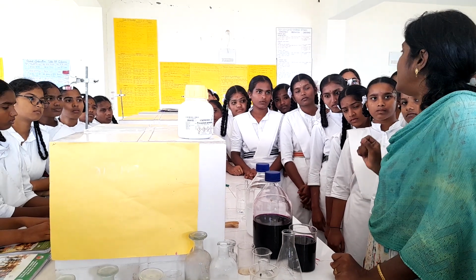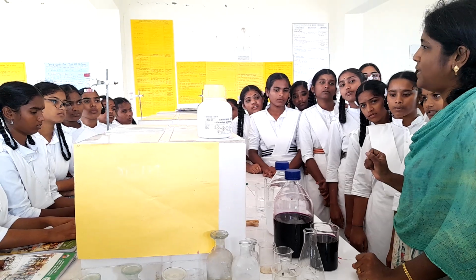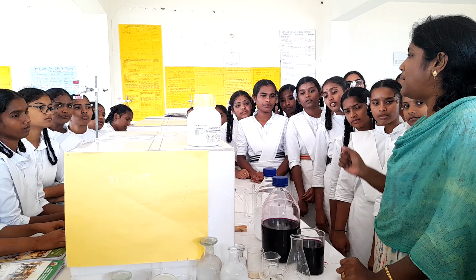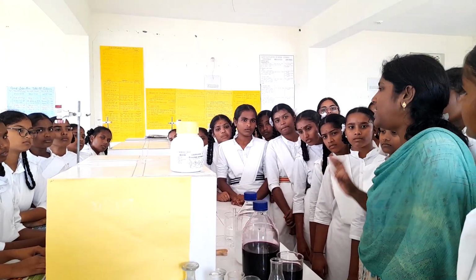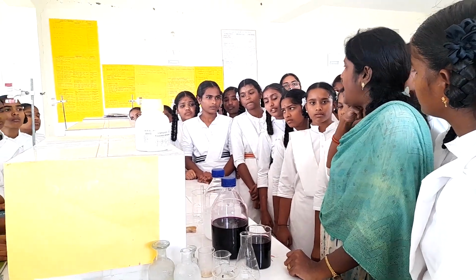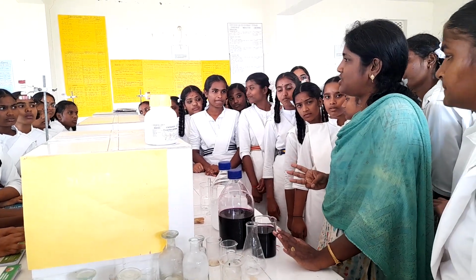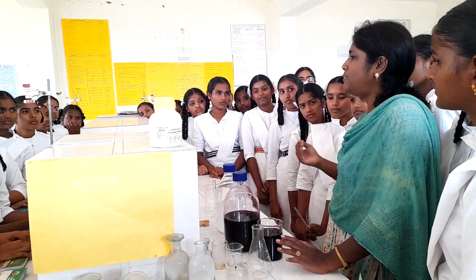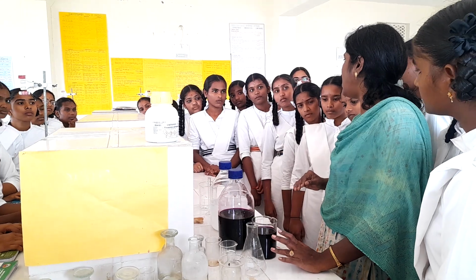So you have to titrate till the point where you get a permanent pale pink. Am I clear? You have to get permanent pale pink. That means the pink you get as an end point should retain. It should not disappear. That becomes your end point. And you have to continue with how many titrations? Three titrations. The first titration may be a little bit more, but the second and third consecutive readings must be the same. Till that point you will be continuing with your titration.